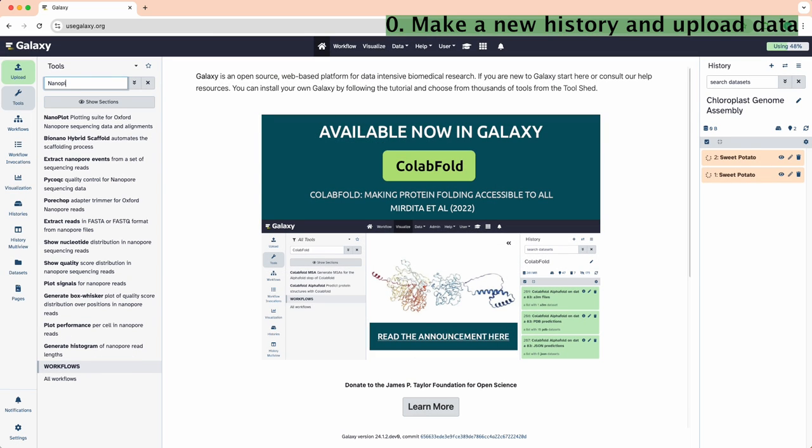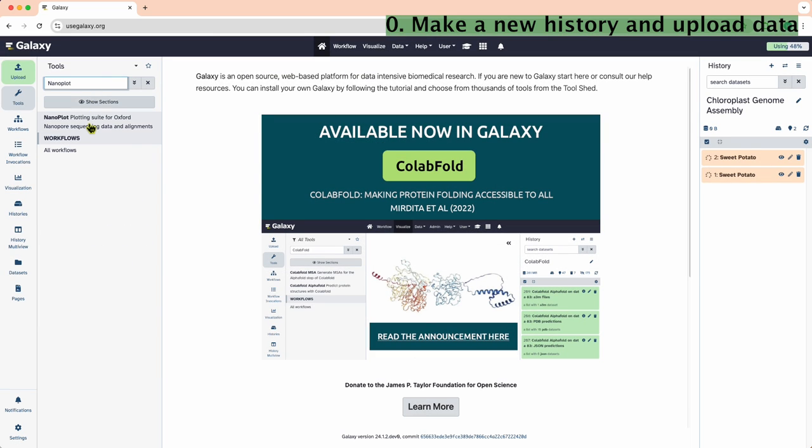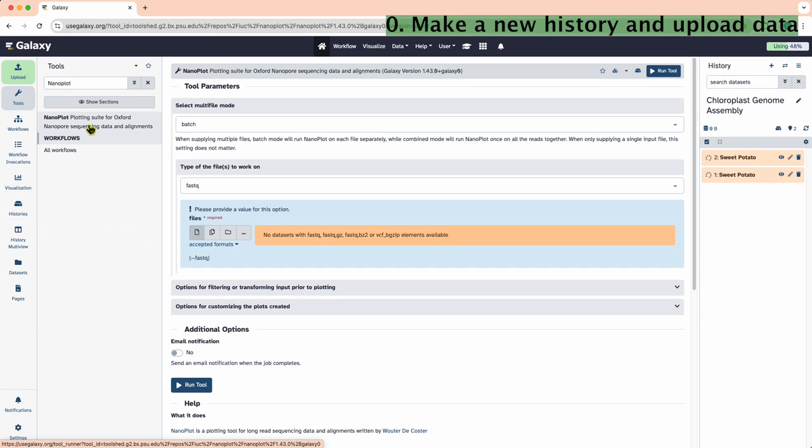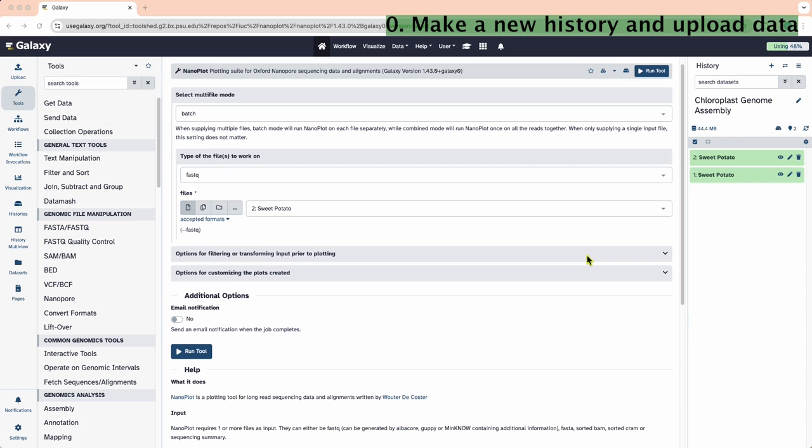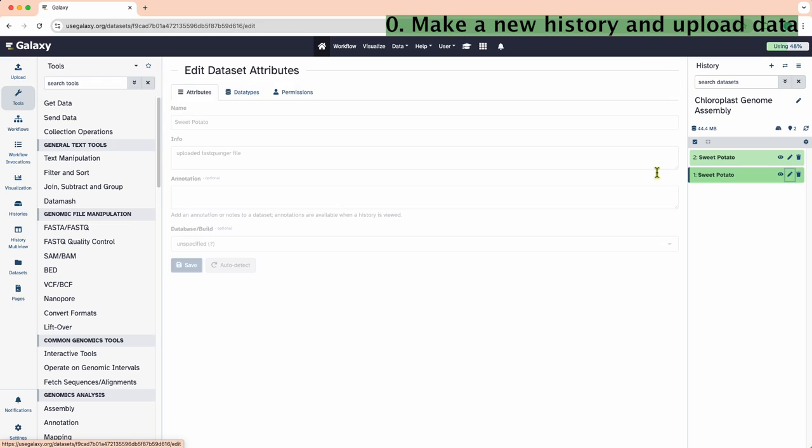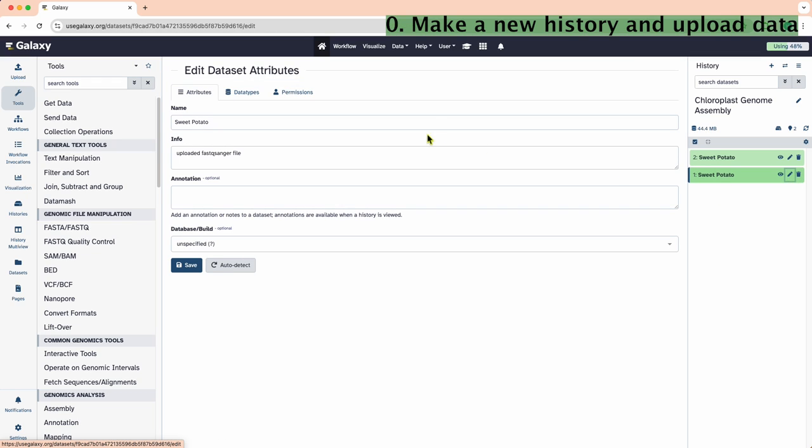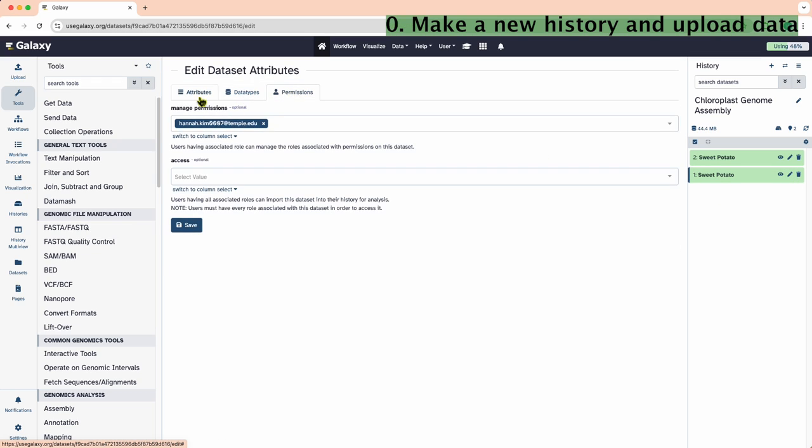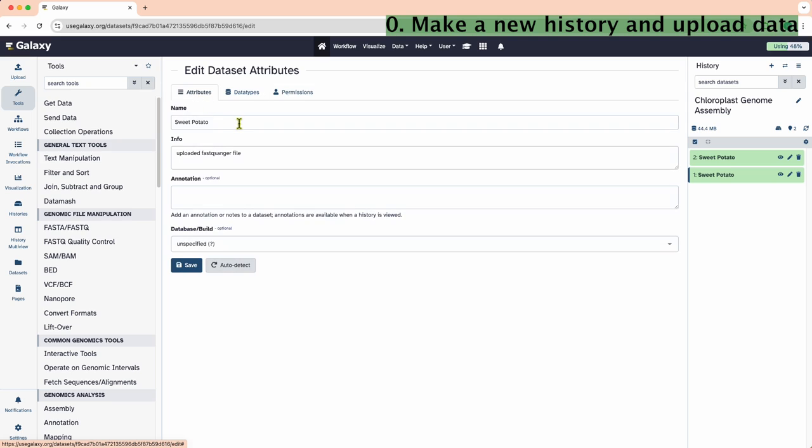While the data is uploading, search for NanoPlot in the Tools tab. We can see that we need to rename each dataset to tell them apart. Rename each dataset by clicking the pencil icon in the history. Under the Attributes tab, update the name field as appropriate.